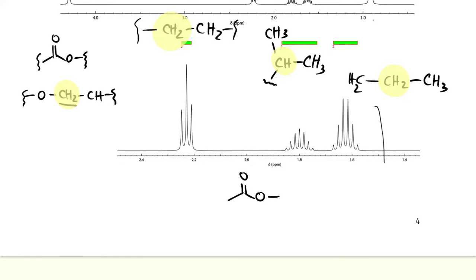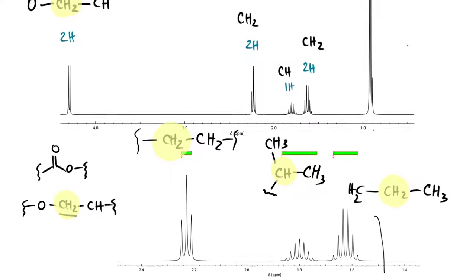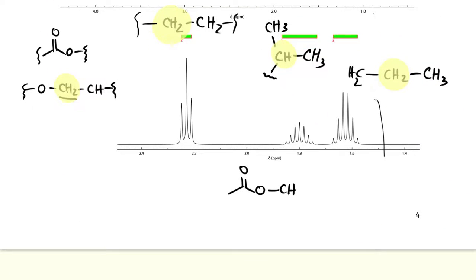And our possible CH2, right? CH2. And so the chemical shift matches because it's attached to the ester group. So that will be the farthest shifted peak.